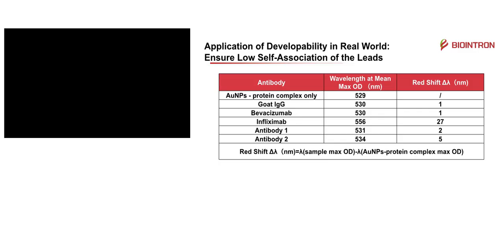We wished to find an explanation on why this antibody has a very high AC-SINS score, and we checked the literature, which said this antibody needed formulation optimization. So that gave us indirect evidence that this antibody might have some strong self-interaction and need to be optimized in formulation.